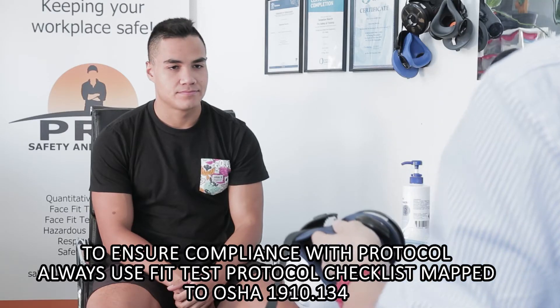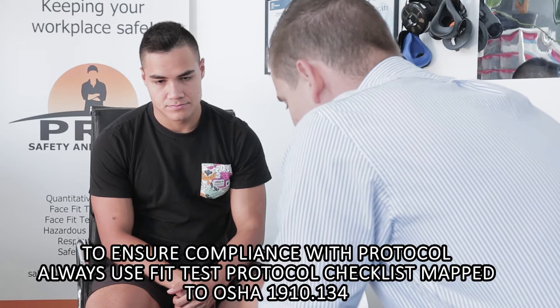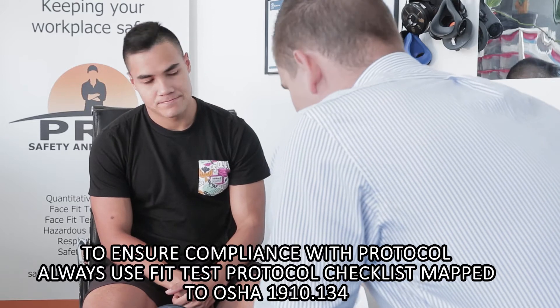Okay, so James, what we're going to be doing here today is we're going to be doing a fit test on this master's here, Sundstrom SO100. You've worn these before, haven't you? Yes. Excellent. So let's start off and get everything ready.